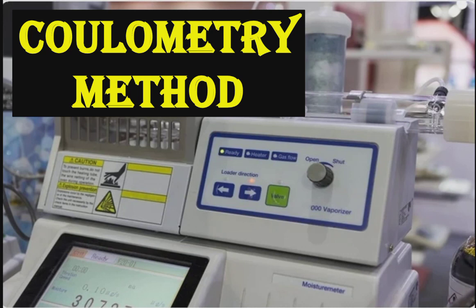We all know that for an electrolytic reaction, electricity is very important. By this method, we can get the complete quantity of electricity that is needed to complete one electrolytic reaction. This type of technique is based on Faraday's law of electrolysis.